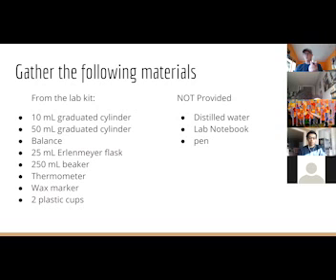And it has a narrow top because generally when we do reactions, we do them in flasks. We'll heat them, reactions will go on in there. And basically what we don't want is the stuff to come flying out of it. And so we generally don't do reactions in a beaker. If we do, they're generally mild reactions, like we're dissolving something in water, something that's not too dangerous.